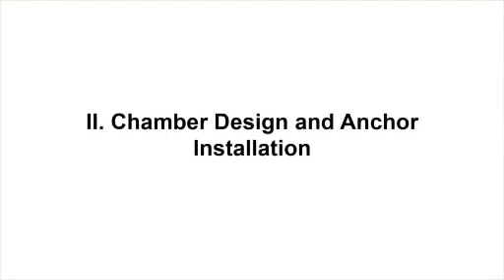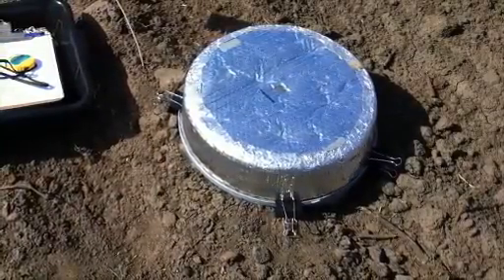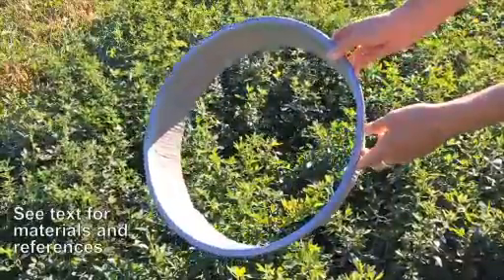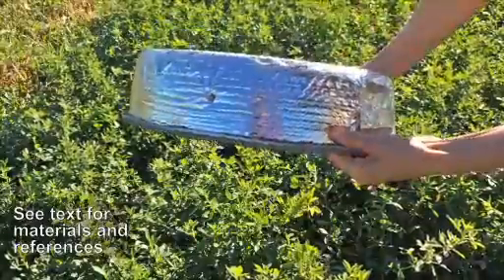A variety of chamber designs exist. Each chamber contains two parts, an anchor that is inserted into the soil, and a lid that is placed on top of the anchor during flux measurement.